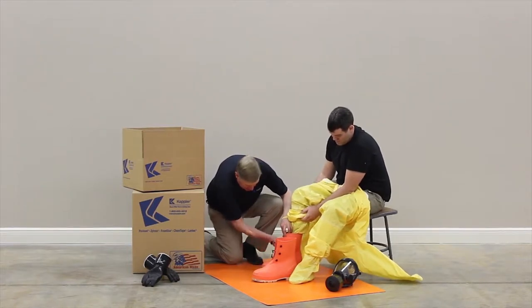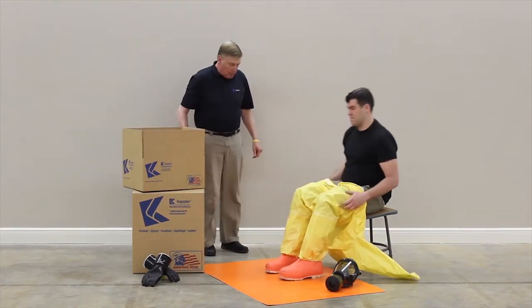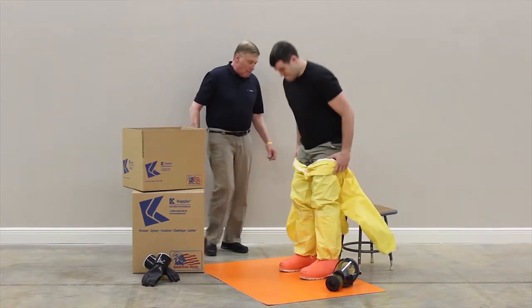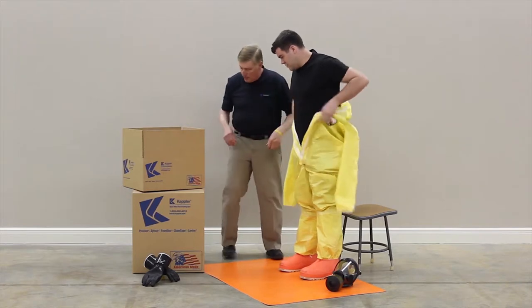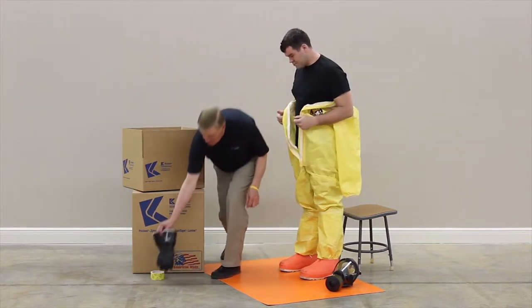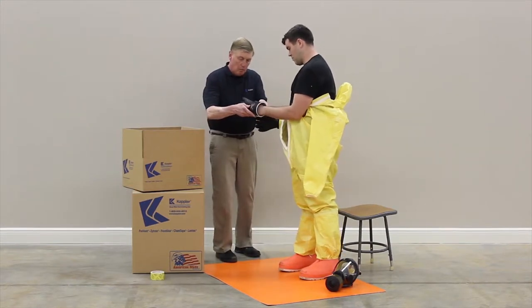Don the outer boots and fold the splash flap down over the boot as far as possible. Don gloves if using AGOAR glove cone inserts.